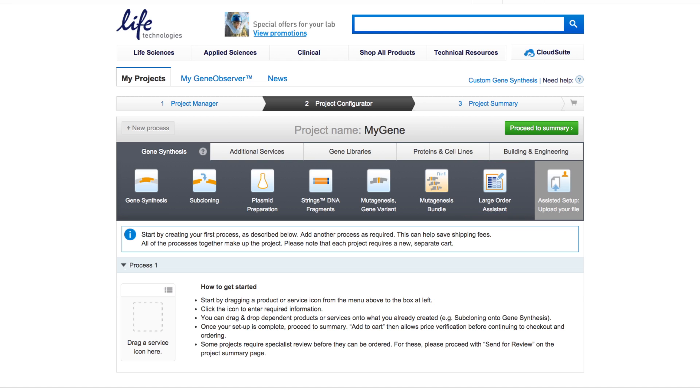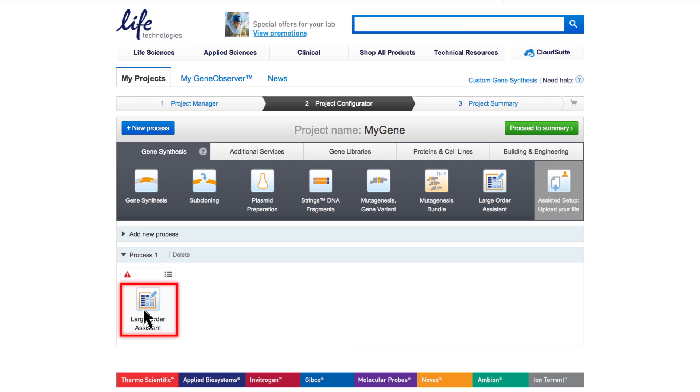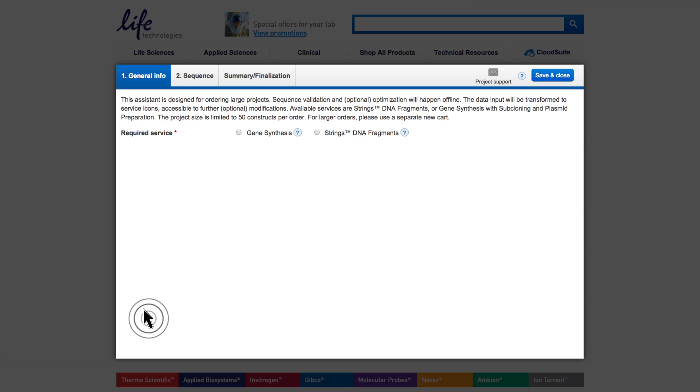To start the process, drag and drop the Large Order Assistant icon onto the drop area. Then open the tool by clicking the icon. The first tab collects some general project information.